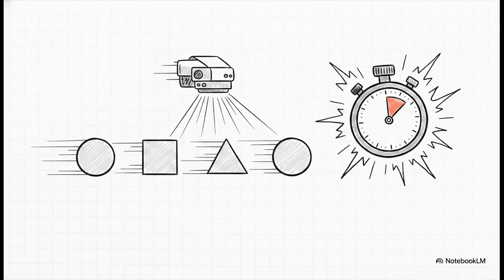But of course, there's a catch, and it's a major technical drawback all about speed. The mass spectrometer has to be unbelievably fast. It must completely determine the mass spectrum of one component before the next one exits the chromatography column. If it's even a little too slow, the first substance gets contaminated by the next one riding right on its heels.